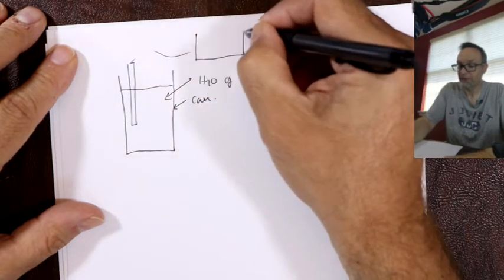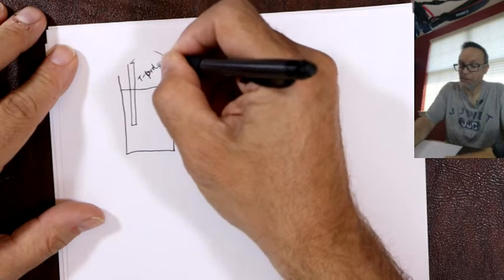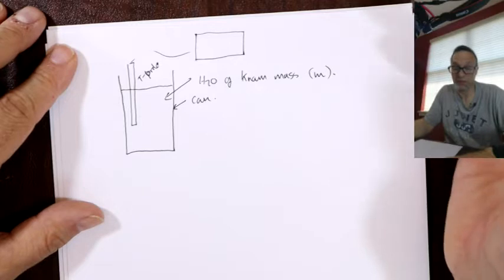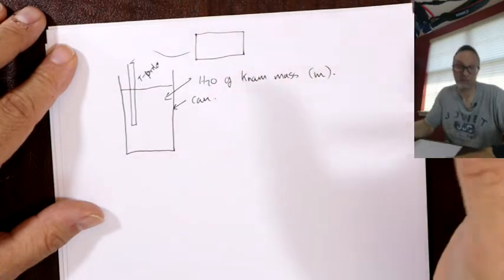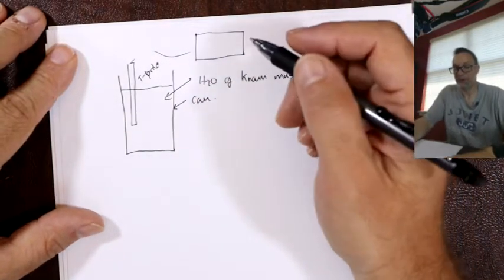Now in the lab, that would go off to a graphing apparatus and we can actually make a graph, which is nicer. It's better than the one we see in the video, which is just measuring the low and high temperature by eye with a regular thermometer. But just think of that as a thermometer. Okay, so far so good.